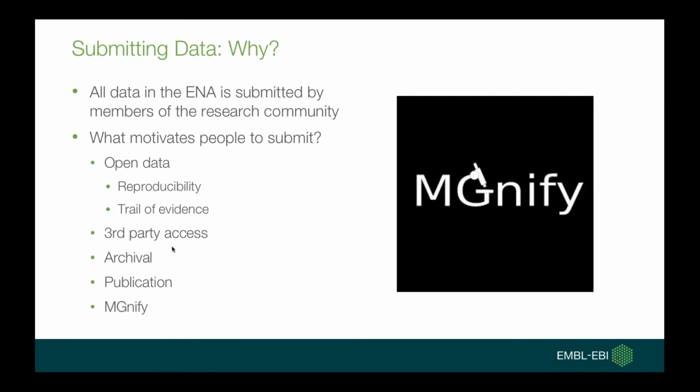And finally, there are groups like MGnify. MGnify are a group here at EBI, and they work with metagenomics. If you upload metagenomic data to ENA, for example, then you can get some free analysis done on it by MGnify. They'll give you some information about the taxonomic makeup of the community that you've sequenced. So there are these practical analysis benefits that you can get out of submitting data as well.